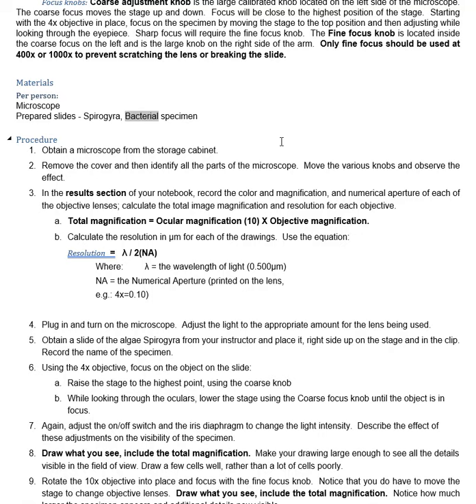Guys, I can't tell you an exact thing, because this is called tweaking. You just make teeny tiny fine adjustments until you got it perfect. Now, you're on 40X. You've got that guy centered again. You've got a perfect picture. You've got to make sure it's perfect, because when you go up to the 100X, you're going to need oil. Once you put oil on that slide, you can't go back.